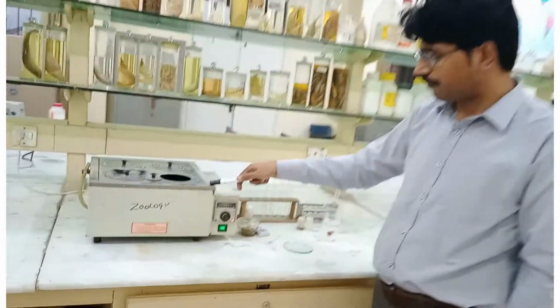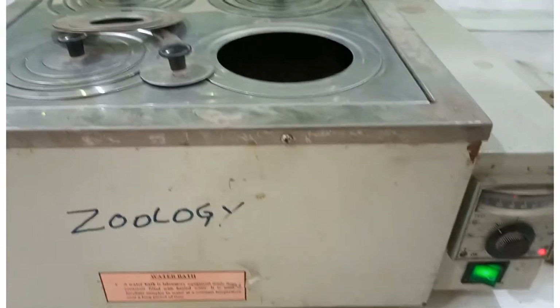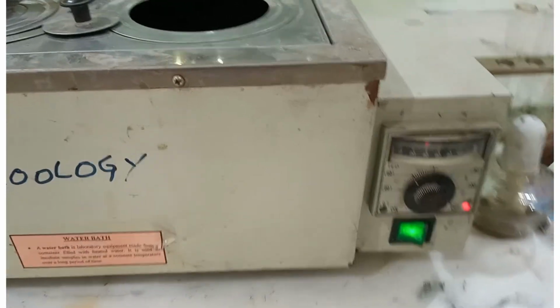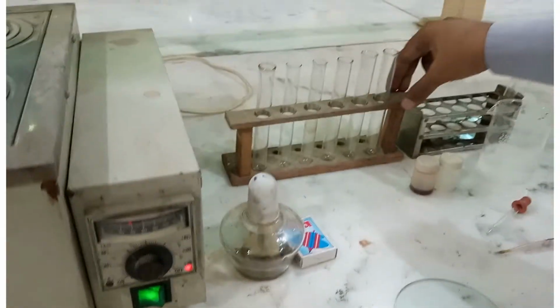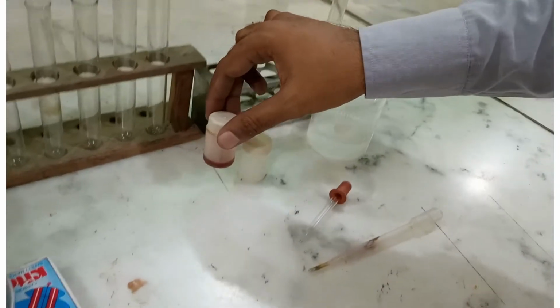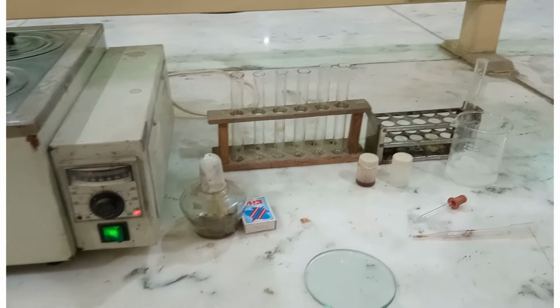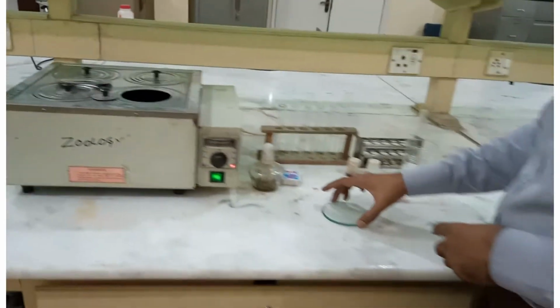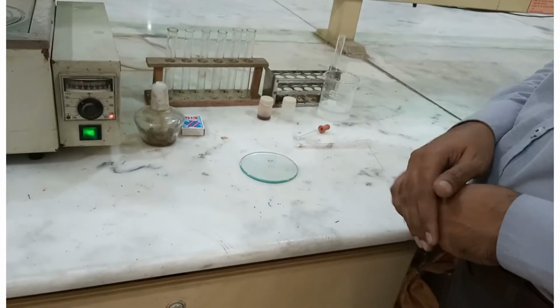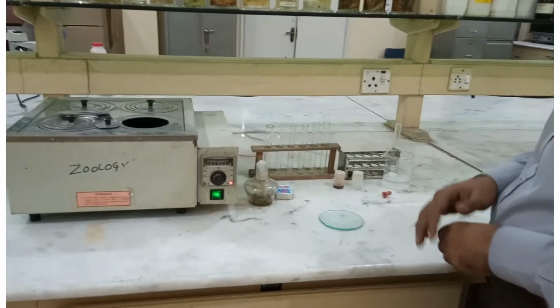We are maintaining our temperature at 37 degrees centigrade. One of the test tubes will be put at 37 degrees centigrade, and then we have a spirit lamp for heating amylase. We have test tubes and saliva solution. We have 1% starch solution, iodine solution, and acid for decreasing the pH. And we have also prepared a base solution to increase pH. Then we have a reaction plate on which we will take drops from the test tubes under different regimes to check the activity of amylase.